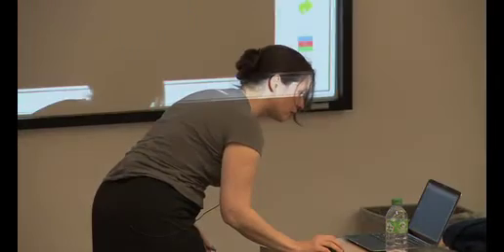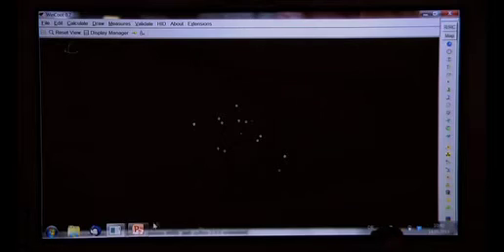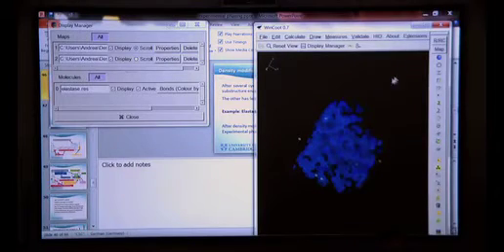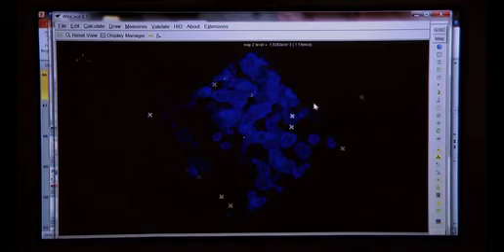So this is one potential substructure, and one of the maps we get looks like this. You can see this map is relatively ragged. Can you see it well? It's relatively ragged. We are not so sure what is going on in here. That could be protein.